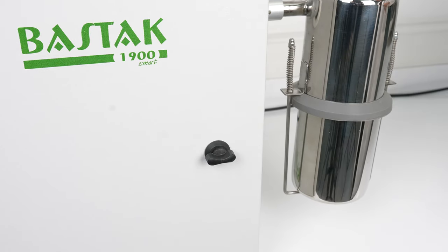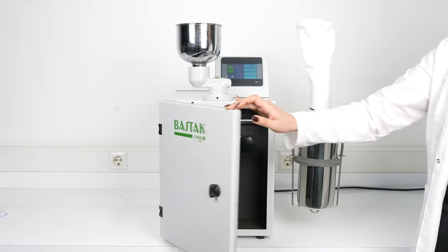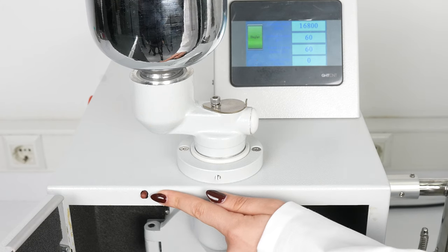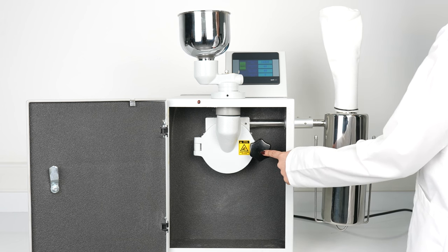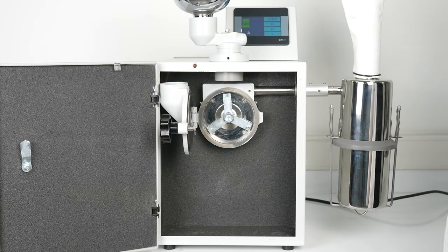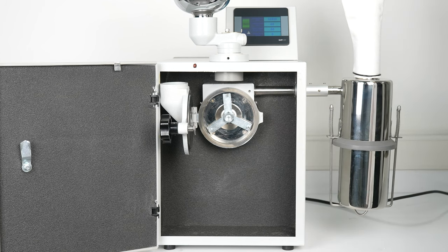The cover lock protects the grinding area for safety. The cover sensor automatically stops the device when the cover behind the front cover of the device is opened. The grinding cell is the unit where the hammer mill that grinds is located. The grinding chamber door lock enables the grinding cell to be opened and closed. The crushing hammer is the hammer that grinds the sample.